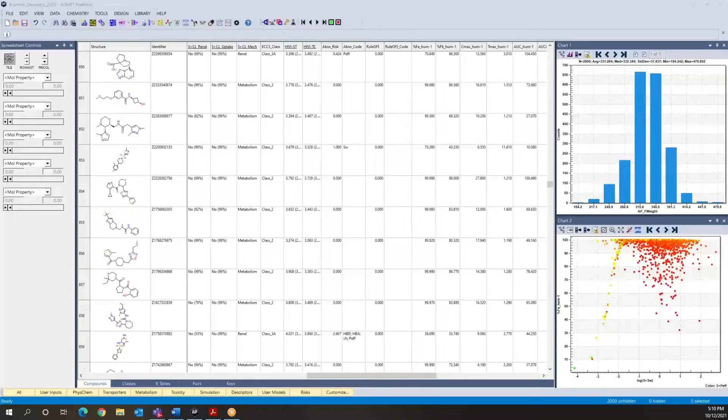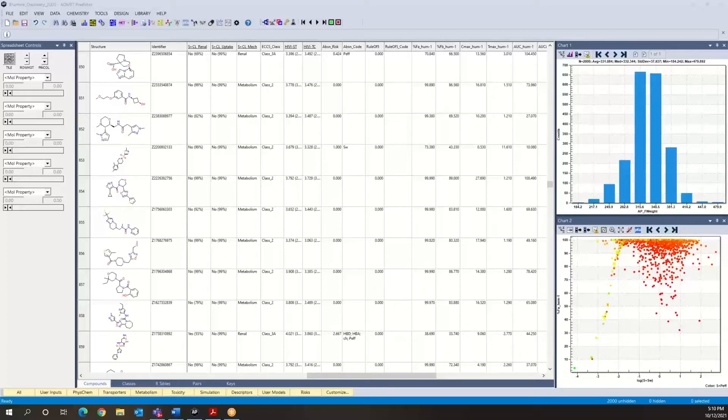Okay, so let's illustrate how we can explore parameter sensitivity analysis within the program. This provides insight as to what may be limiting fraction absorbed for a particular compound.